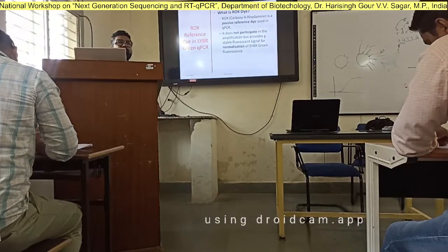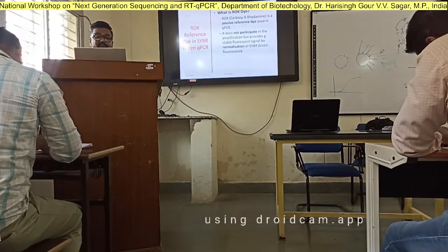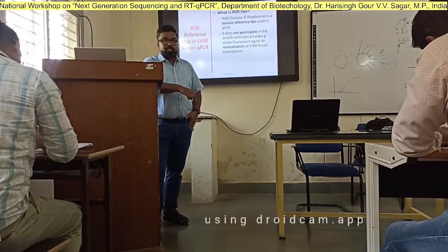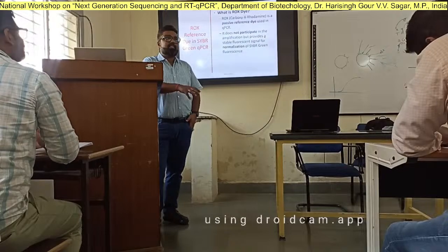Why is it called passive? Because it does not participate in the amplification and it gives a stable signal. Right? So a passive reference dye is something that will not participate in the signal.